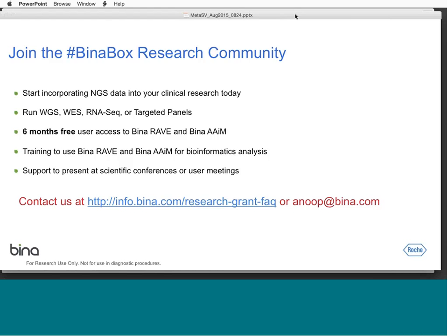Question from Paximadi, how do you handle the faulty results? Could they hide SNPs? We don't really look at SNPs as of now, but that's a good question because a couple of false positives could be removed by examining SNPs in those SV regions.